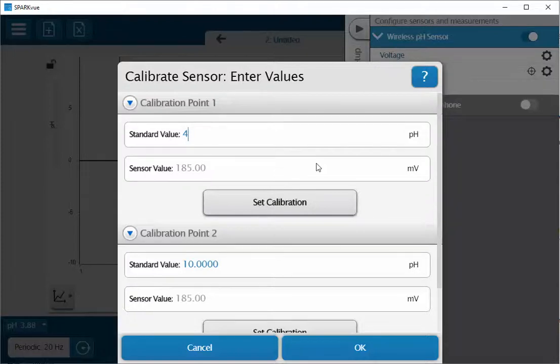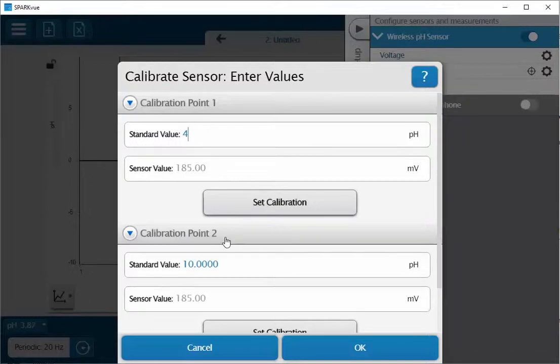Once it is immersed in the solution, wait for it to stabilize. It looks like it's done that pretty much here. I'll go ahead and click on set calibration.